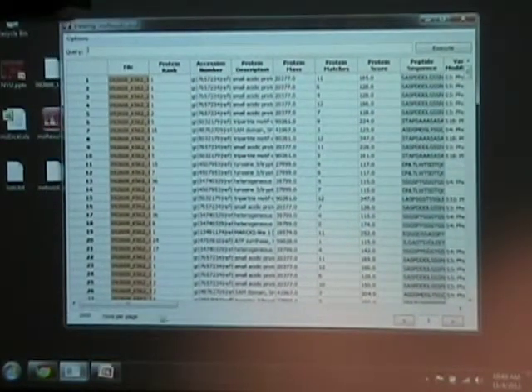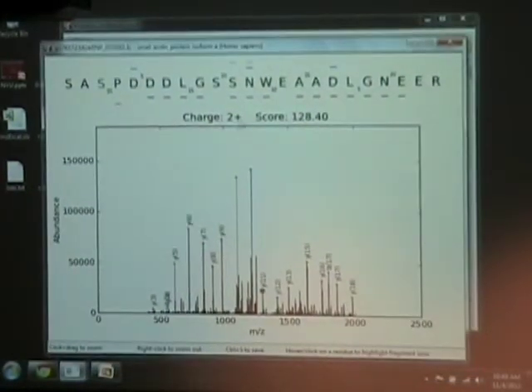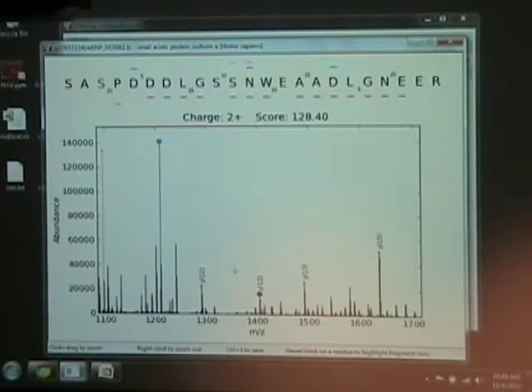You'll be able to see a table somewhat like the one we just saw, except that now if I look at a spectrum and I look at an image of it, it's more of an interactive display, and you can highlight which ions are used to make a call. You can freeze that, zoom in. You can save to PDF.